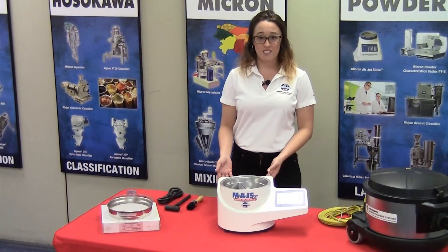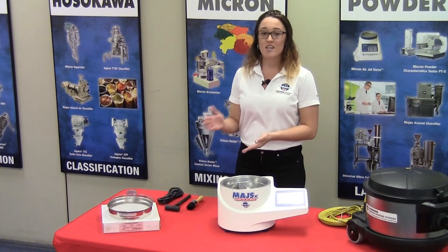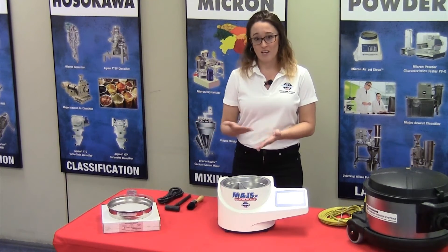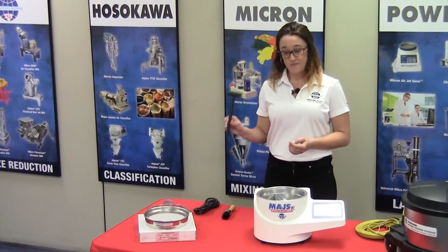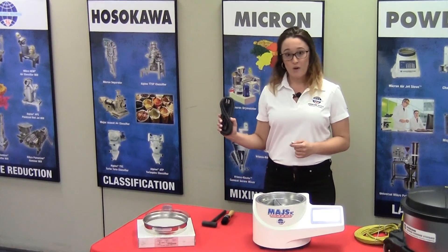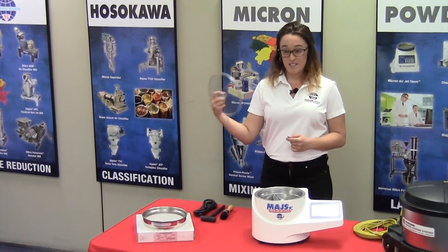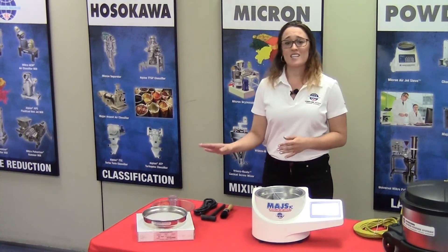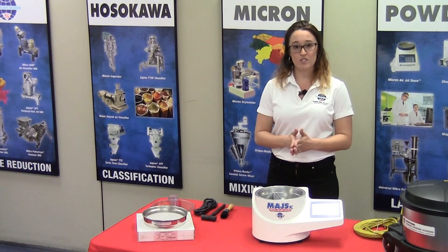Once you've opened the box and removed the Airjet Sieve, you're going to remove the component box as well. This accessory box or component box includes a brush, a hammer, the power cord to the unit, and the test sieve screen lid. Please note the test sieve screens themselves do not come with the unit — you do have to purchase those separately.